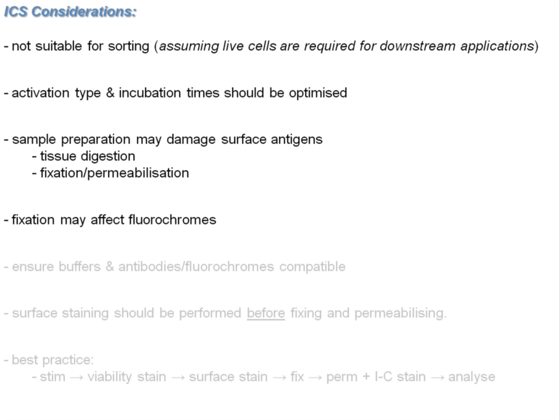Also, the activation can cause the downregulation of surface markers, and a classic one of that would be CD4 expression in human T cells, where if you stimulate them with PMA and ionomycin, it's downregulated, so it's no longer expressed on the cell surface, or certainly expressed at a much lower level and maybe at a non-detectable level. The fixation technique too can affect various fluorochromes, in particular conjugated fluorochromes, tandem dyes. So that's always worth considering.